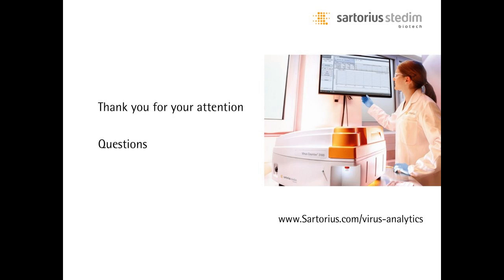Can it be used for retro and other adventitious viruses? So we are currently using it for viruses as a product, and the reason is that our instrument quantification limit is at 5 times 10 to the 5th viruses per milliliter. So if your concentration of the adventitious virus is below this, we might not be able to pick it up.